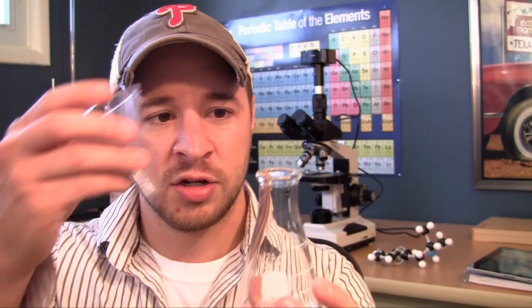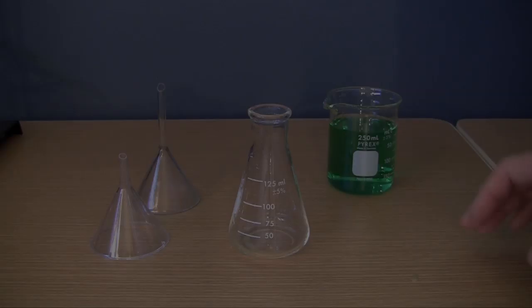Now funnels of course are used whenever you have a liquid or solution and typically it's in a bigger container and you want to transfer it to a container that has a narrow mouth like an Erlenmeyer flask. So they're pretty much used to prevent spilling, really useful.